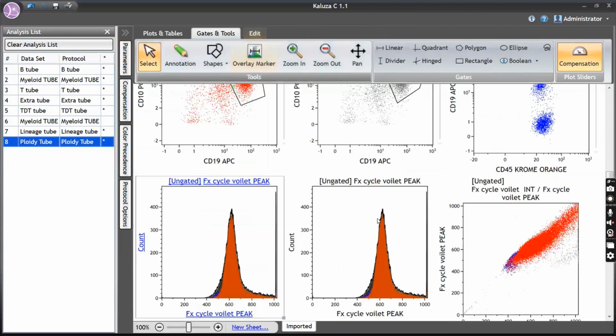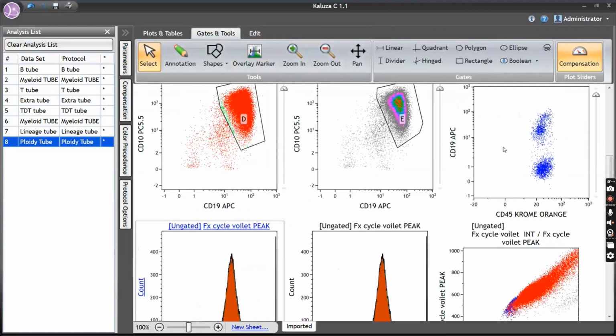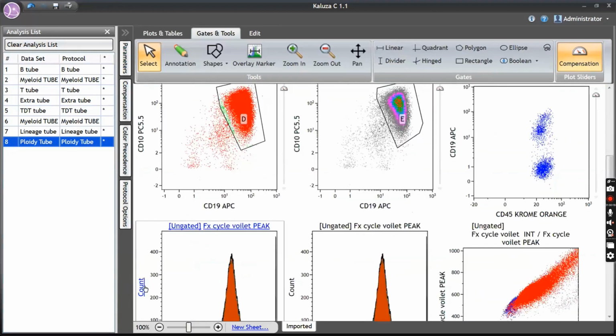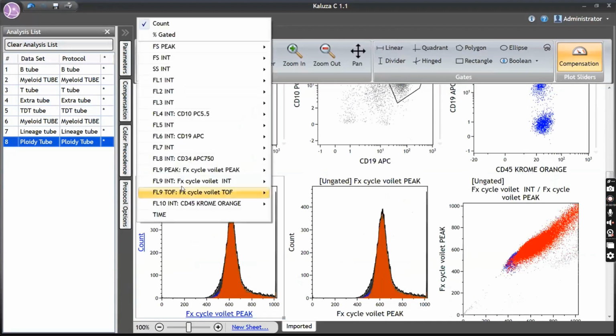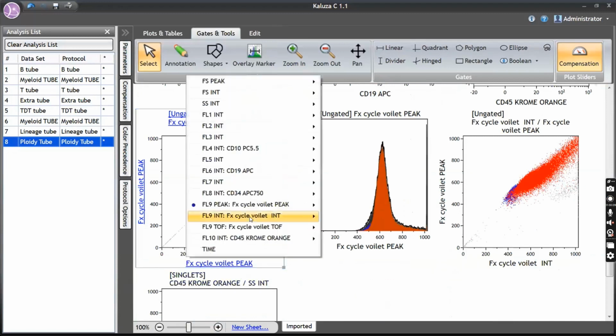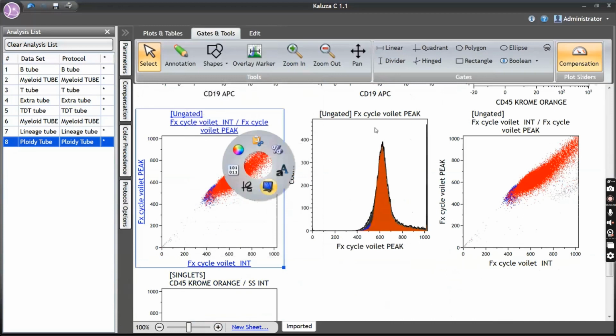Now I've labeled it. Let's see how it goes. So the lymphocyte population has been segregated and the blast population is segregated. Now let's see how to do this. So I'll just drop something like singlets. I draw a plot to refine the blast further. So here is the population.